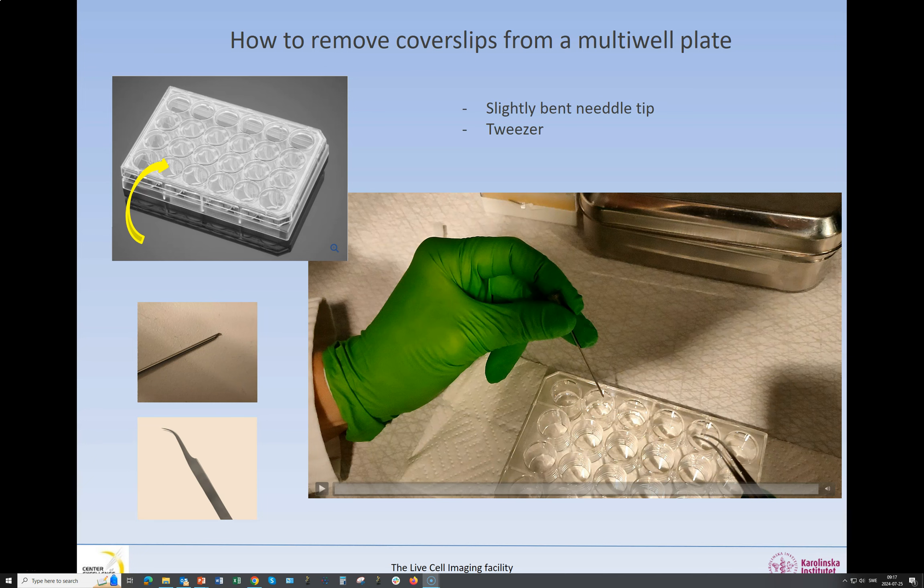Hello, my name is Gabriela Imre and I am working at the Live Cell Imaging Core Facility at Karolinska Institutet in Sweden. In this short video I will show you how to remove cover slips from a 24-well plate.